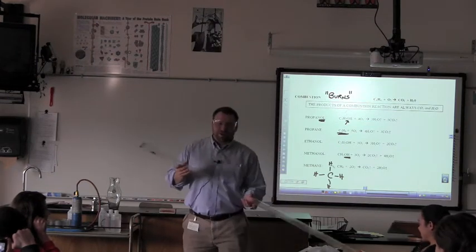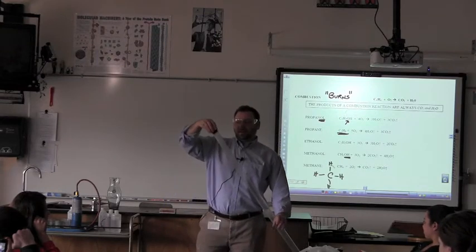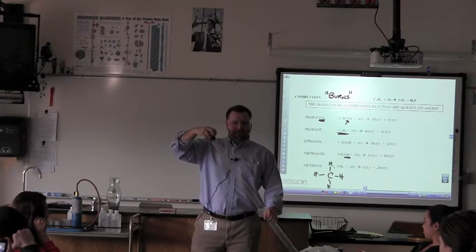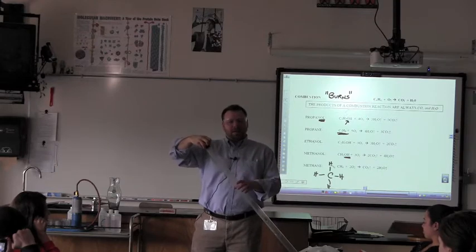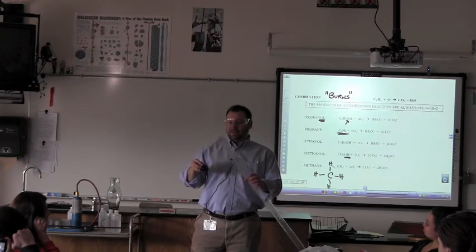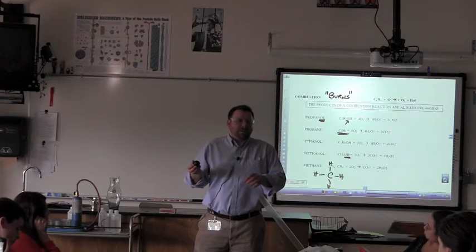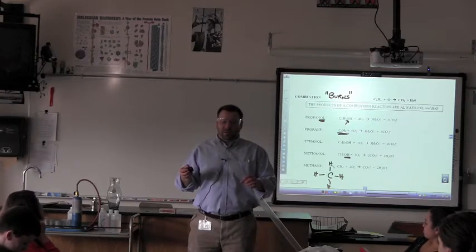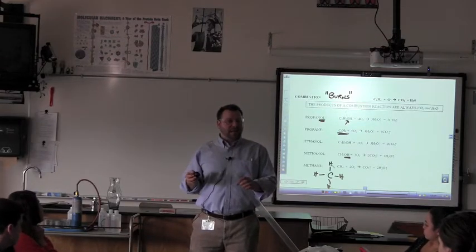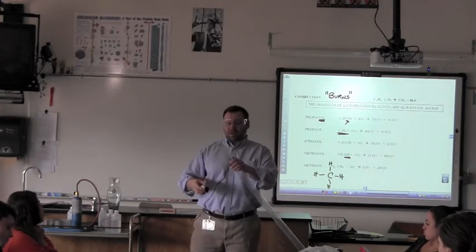Okay, now, I want you to watch this. So first of all, you're going to see two things coming out of the end. What should be coming out of the end? Well, you're not going to see carbon dioxide gas, but you will see, hopefully, water vapor. And there you go. So you see the water vapor coming out. And that's usually how we're going to see water vapor, is a type of condensation there. And that's, again, a sign that water vapor was coming out, just as we would predict from the combustion reaction.